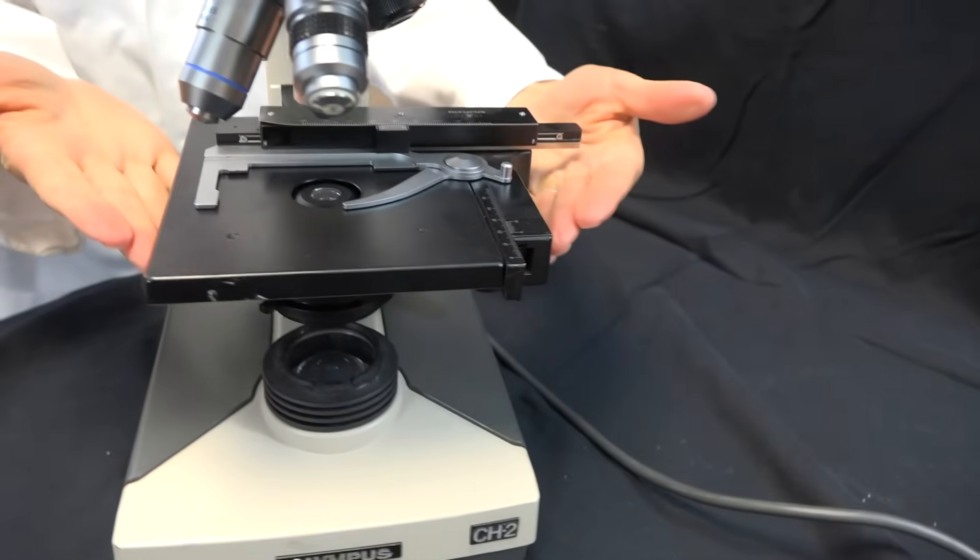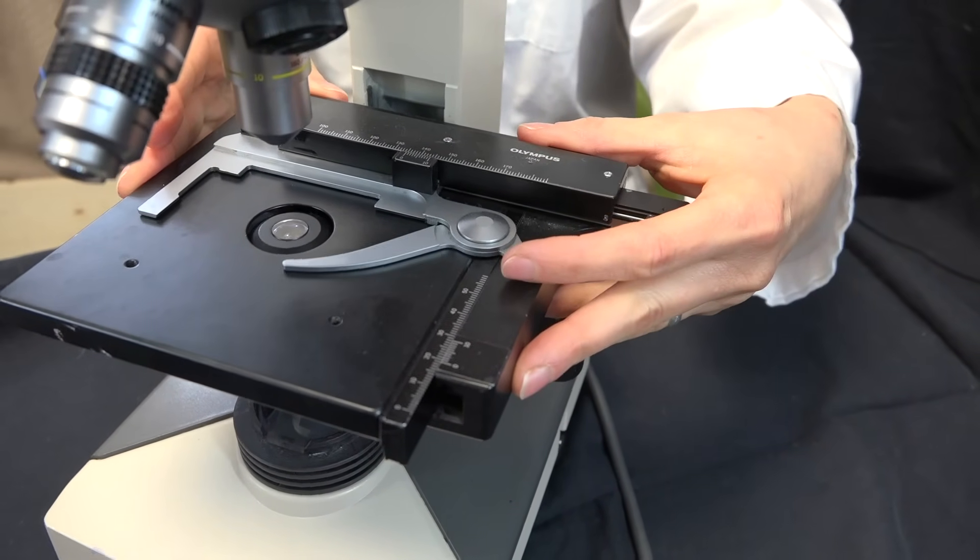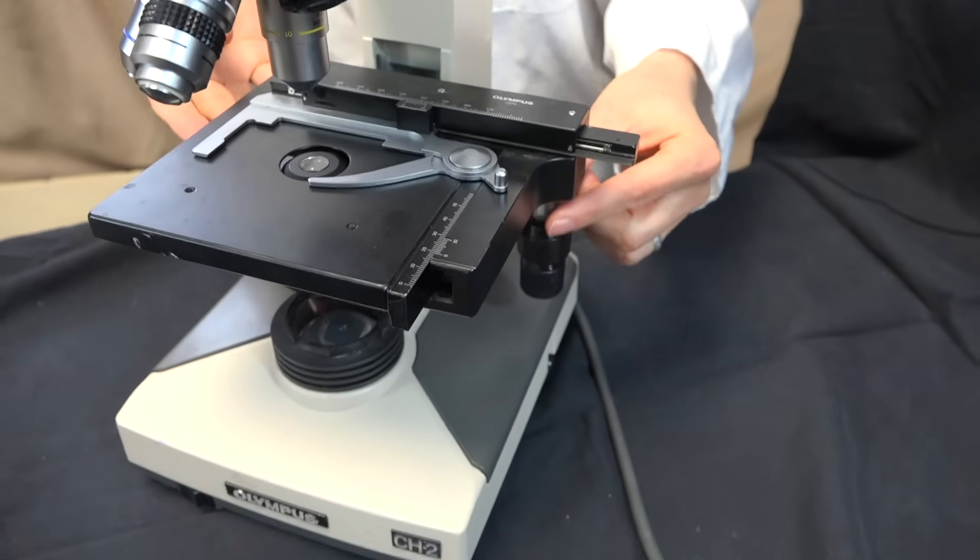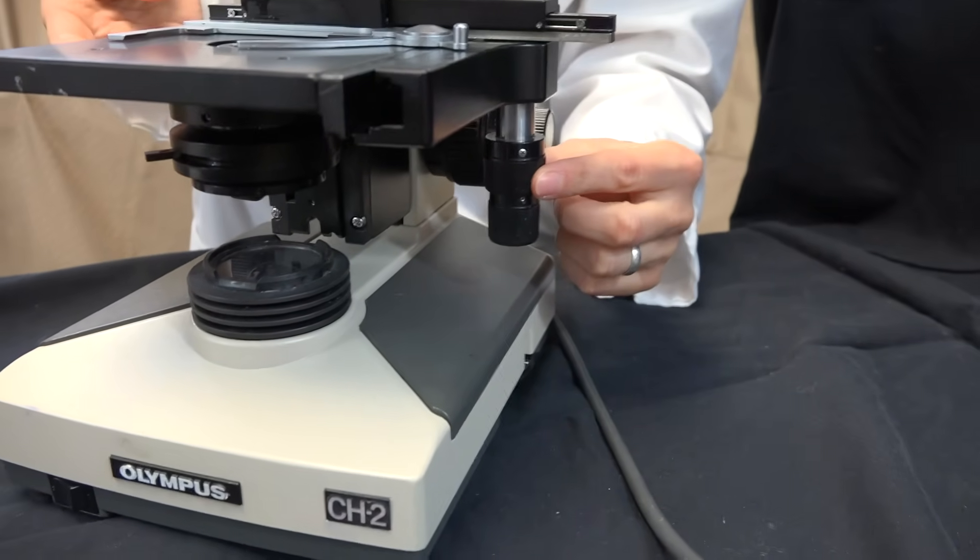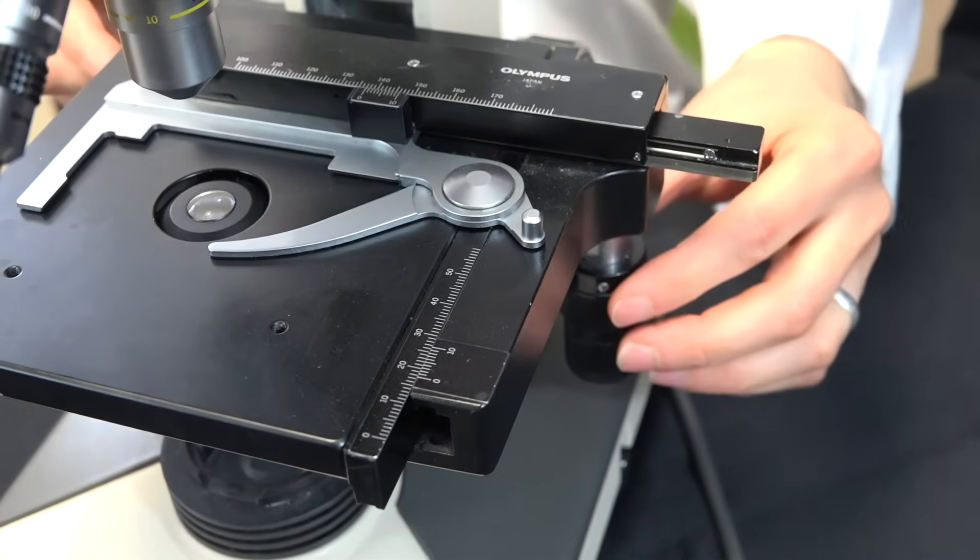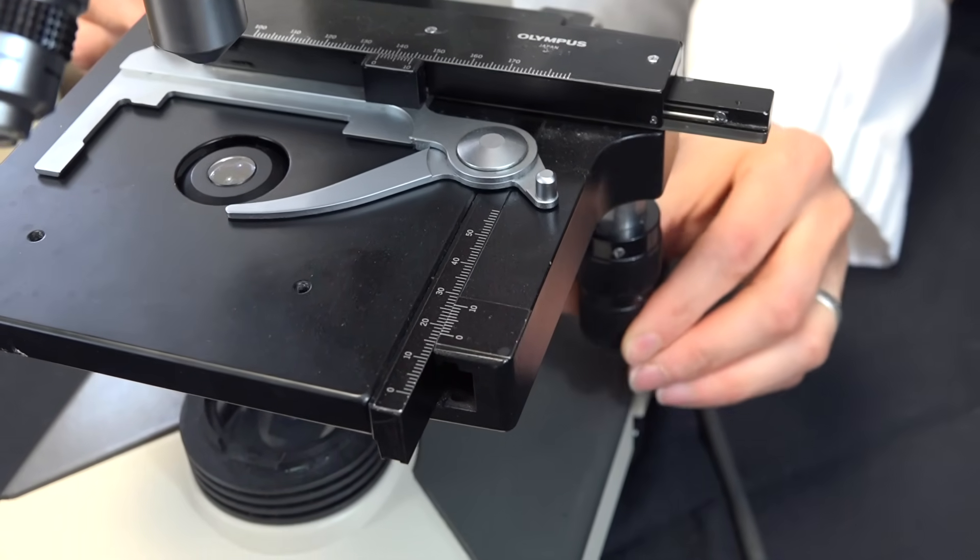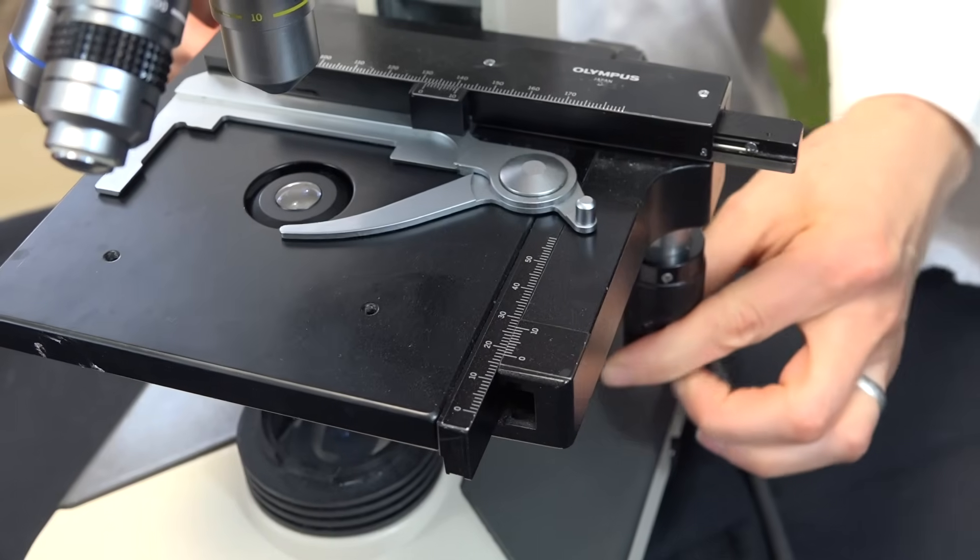Below the nose piece is the stage. On this stage there is a clamp for holding the slide. Below the stage, on one side, there are the stage moving controls. One control moves the stage back and forth. The lower control moves the stage right and left.